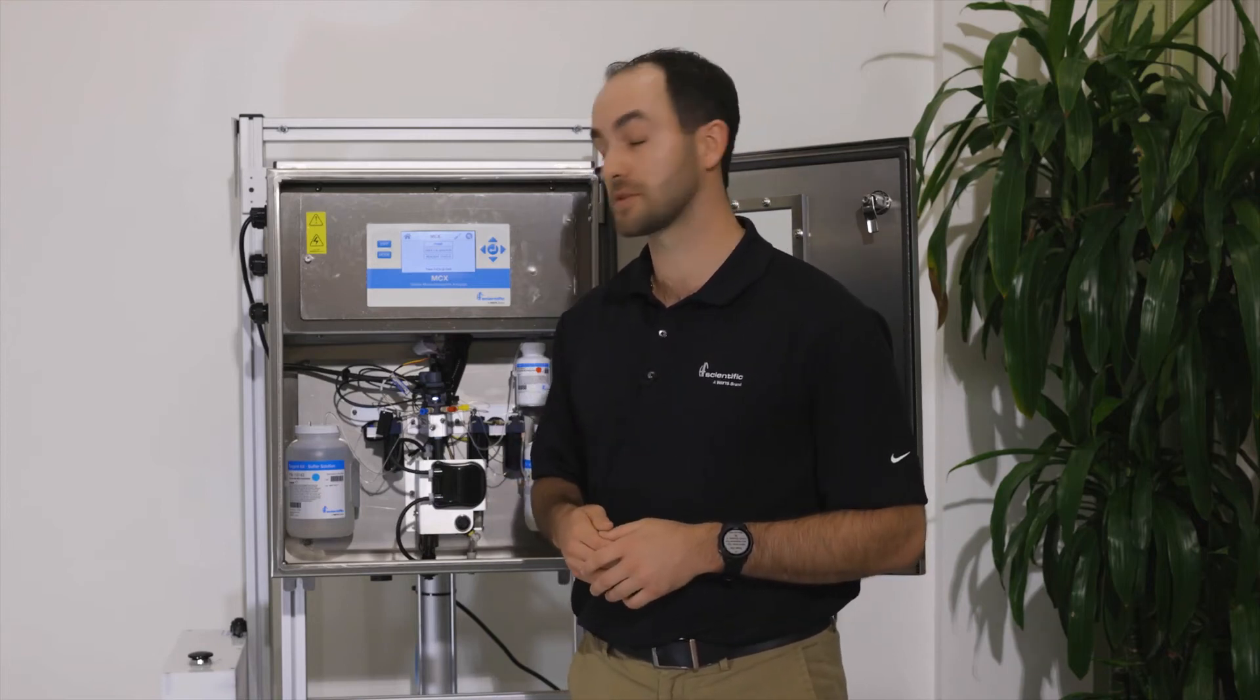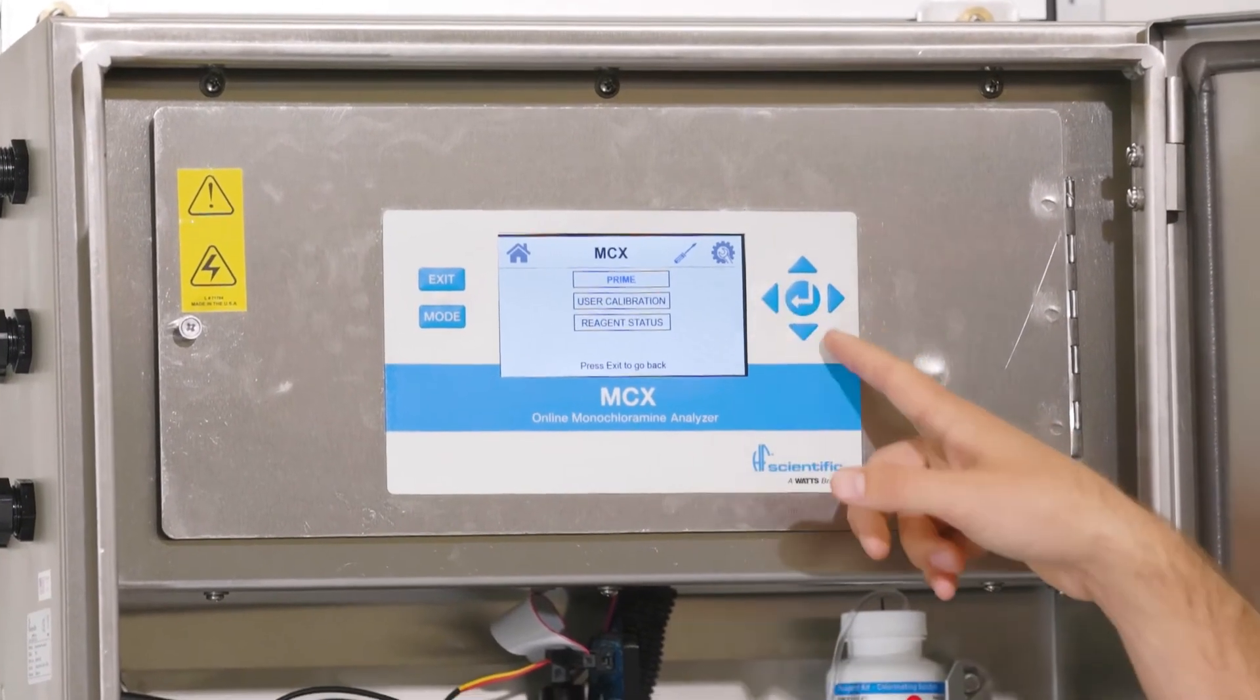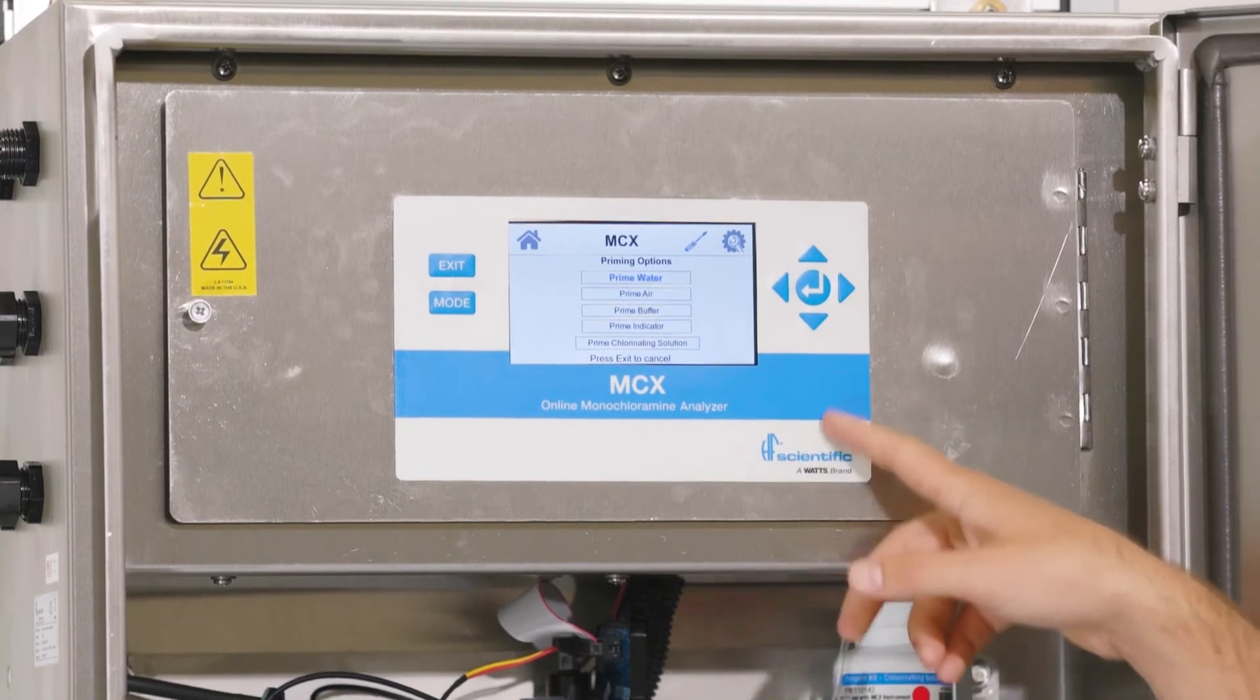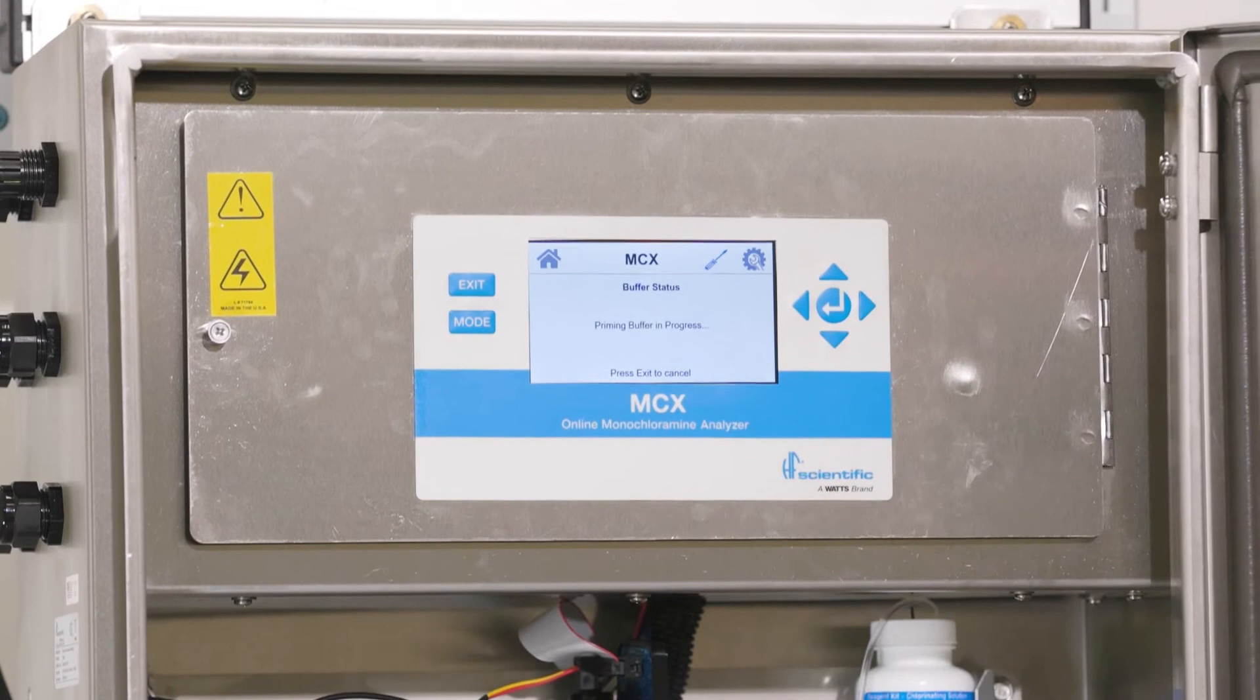Once all three reagent bottles are in, we're ready to start our priming process. We'll start by priming our buffer solution. On the screen, press the enter button to select prime. Use the down arrow to go down to buffer and hit the enter button to prime the buffer.